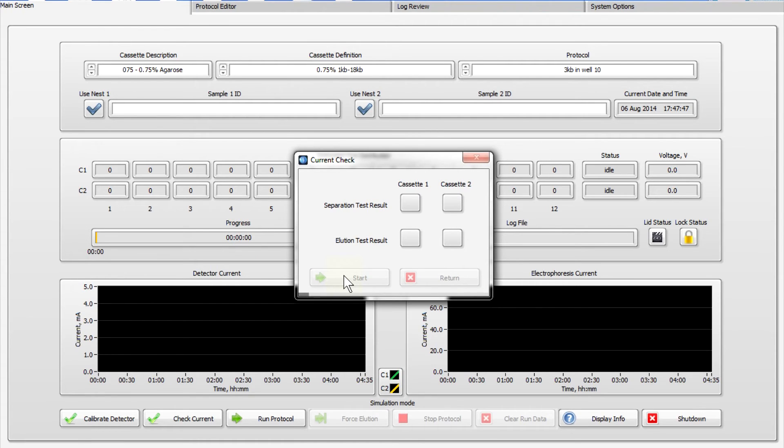A pop up window with a progress bar will appear. At the end of the test, the lid will disengage and the window will indicate whether current test was successful for the separation and elution channels.